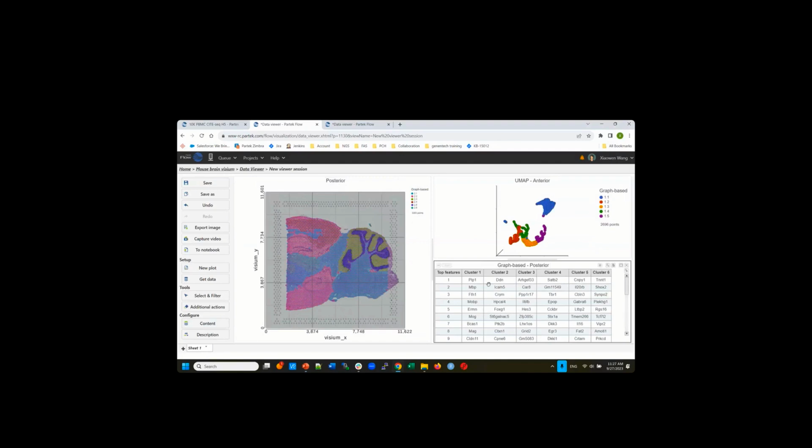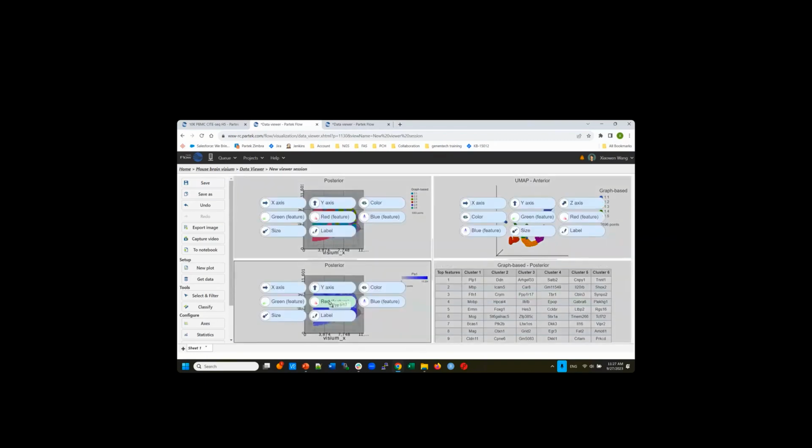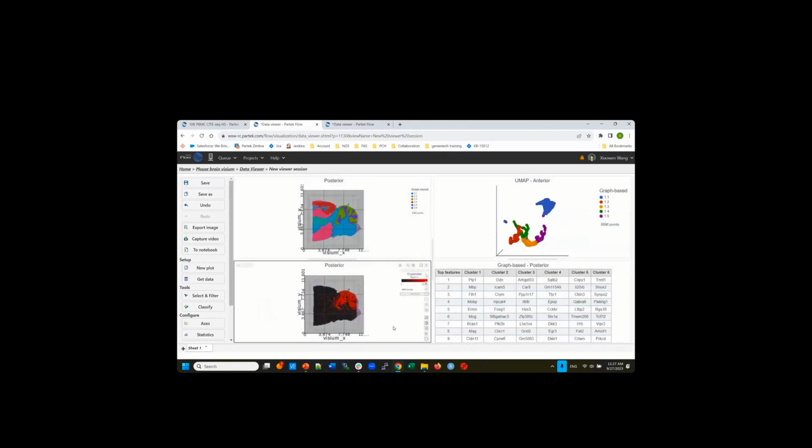So suppose I can see this gene information. Let me just duplicate it. I like to duplicate it. This is using statistics to color my tissue type. I think it kind of makes sense. And now I'm going to overlay the biology to color. And then if you see some familiar genes, you just color them to look at it.